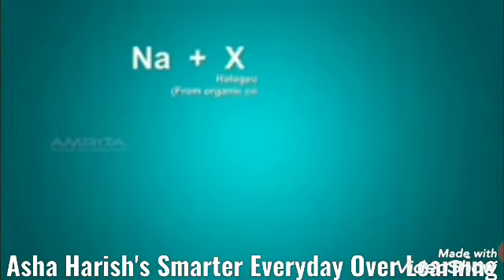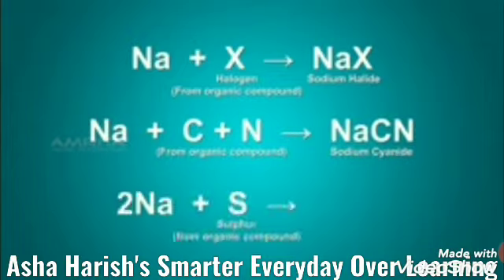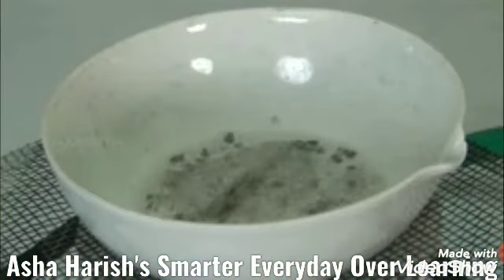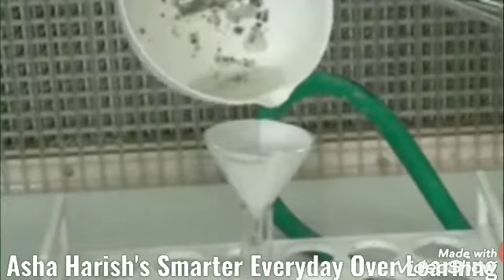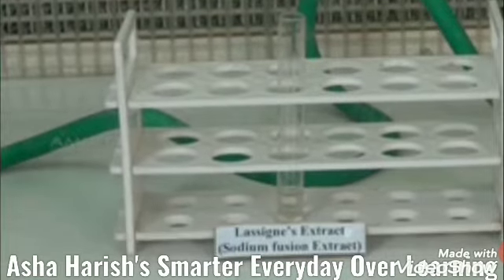And what apparatus do you need to take for doing this extraction? This is the fusion tube, and these are the equations of sodium metal with halogens and cyanide also. These are the chemical equations you are seeing on the screen. And now it's a boiling process of a small piece of sodium metal. Here is the organic compound.